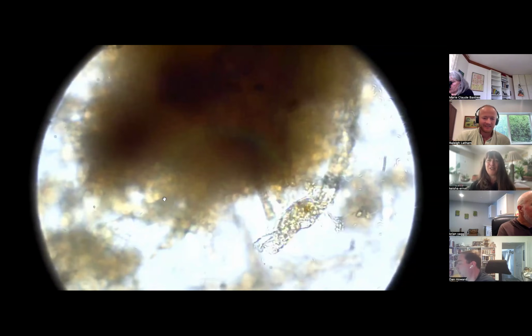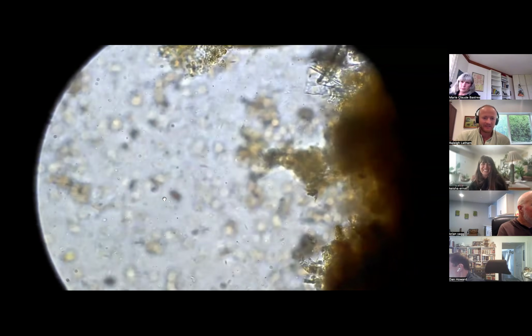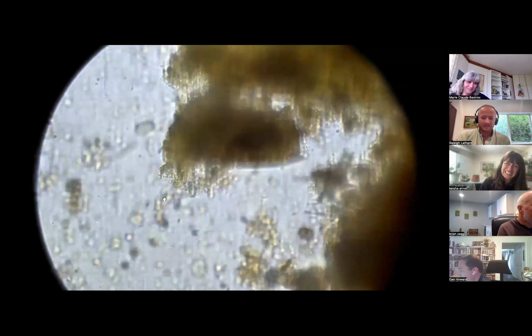Marie, that's what she wanted to share. She's got some video. She's got her awesome samples. She's also got a video of fungi eating a nematode. Oh, that'll be cool. It's pretty wild.